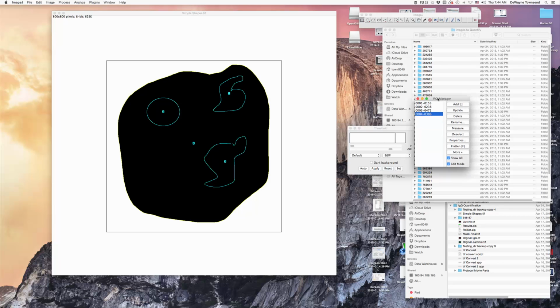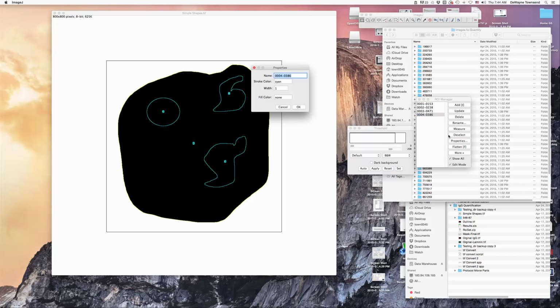So the ROI manager we mentioned earlier has some nice little features. One of those is that you can change how the different ROIs show up. You can do that using properties. Let's say that instead of this nice blue color, we want the outline to be green. So we type in green, and okay, and now you can see that it's green. So this is all very nice.